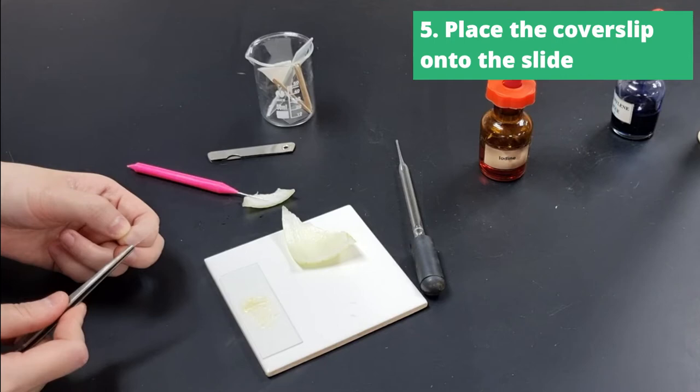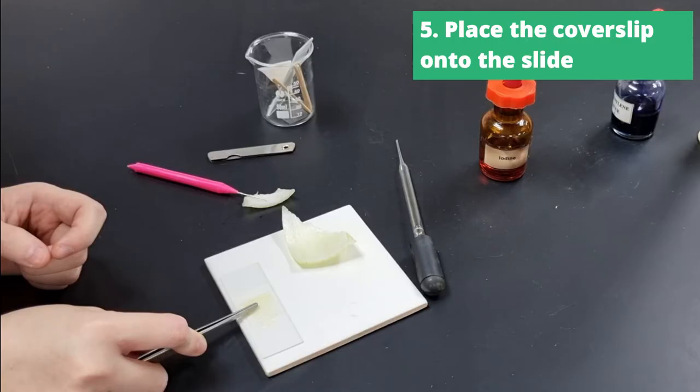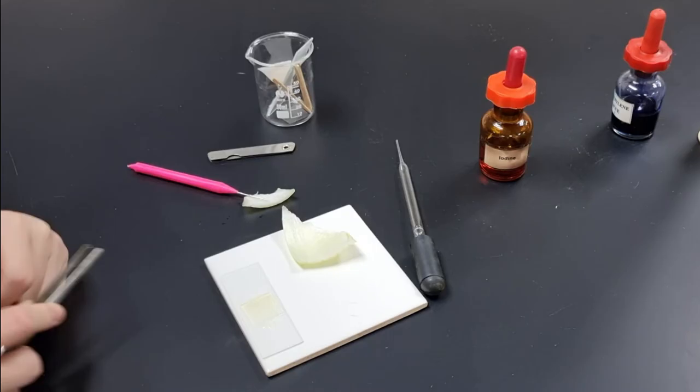Now we're going to take a cover slip, it's a square piece of plastic, and we're going to lay it down on top of the onion layer. Notice I lay it down on one side and then slowly lower it on the other side, and this actually helps to avoid any air bubbles.